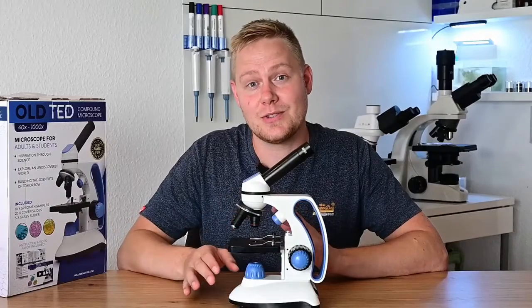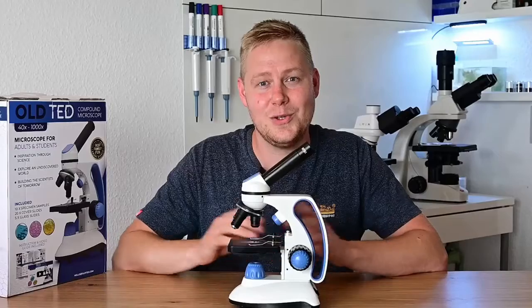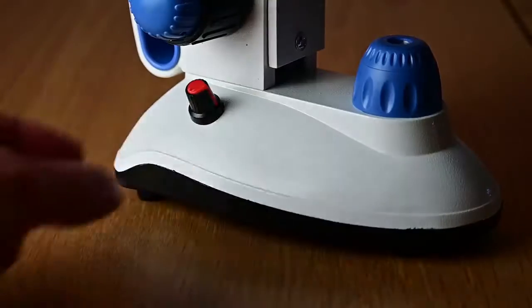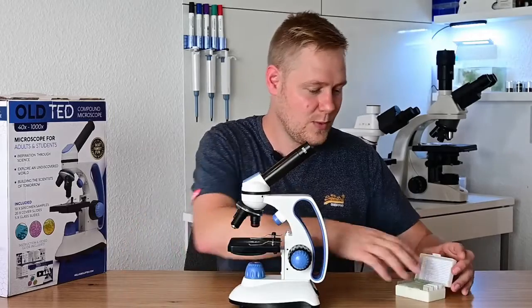To turn on the bottom light source, press the power button to 1 and 2 for the top light source. You can control the intensity of the light with the dimmer on the side. Now you're ready to insert a slide with your specimen.